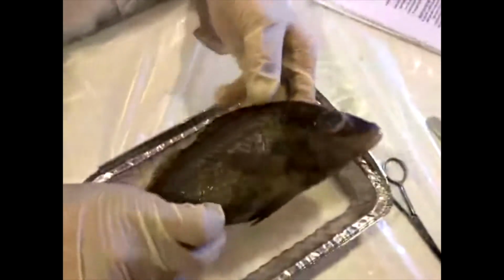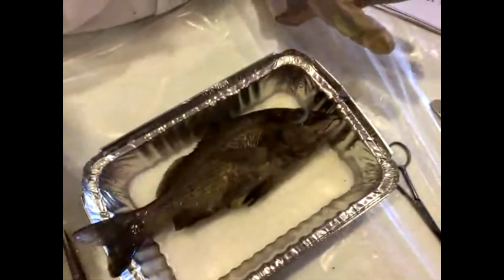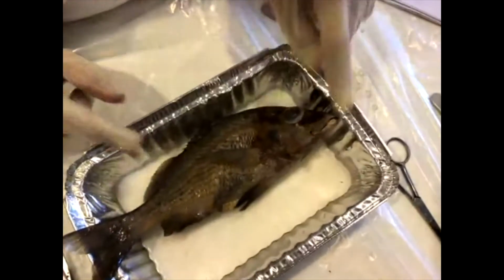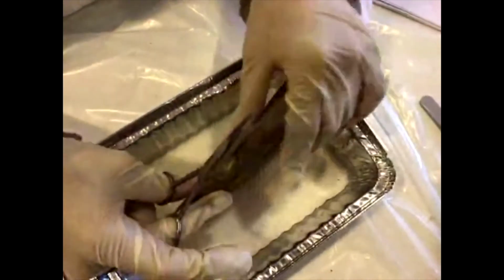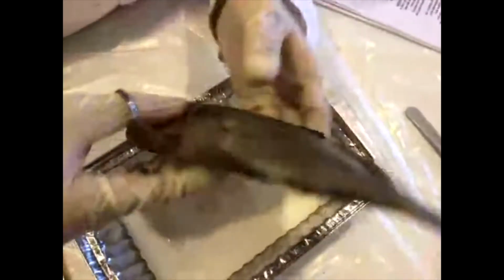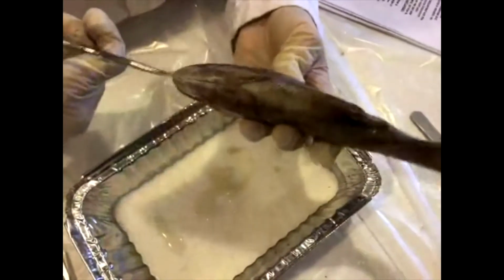Okay, so I think we're ready to start getting into the internal anatomy. If you haven't already, make sure you're putting the rays on your fins, your eye, and your mouth here. And we're going to start cutting. Now, maybe while I'm starting to dissect, because it's going to take me a minute to get it open here, we can brainstorm and you can throw them in the chat, different types of organs that we have in our bodies that we actually need in order to survive.